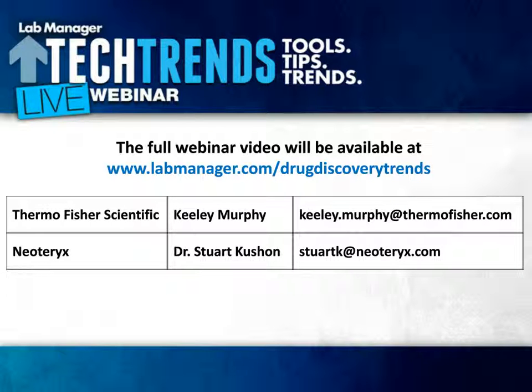Great, thank you. Stuart, acetaminophen has a very low log P and is very soluble in water and methanol. How do you handle compounds with a higher log P?